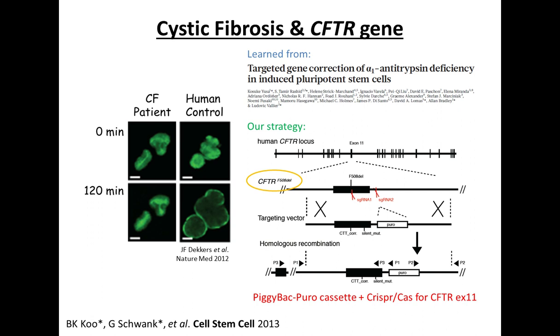We designed two guide RNAs. One targets the mutant site, another one targets the puromycin insertion site.